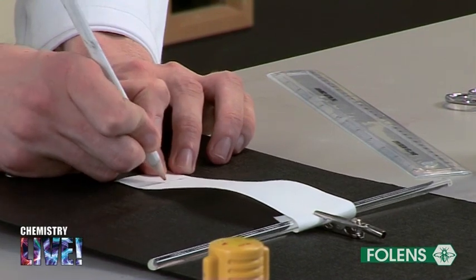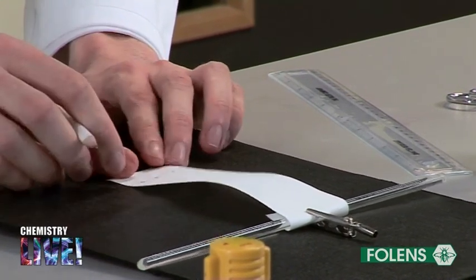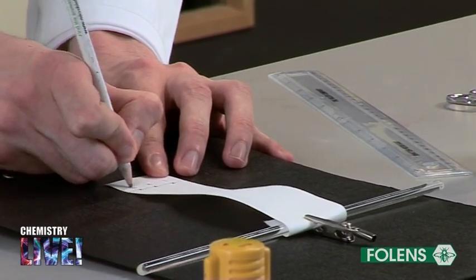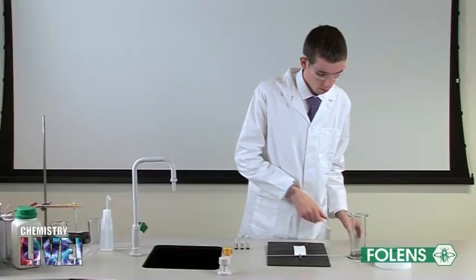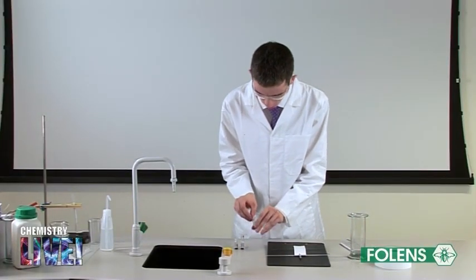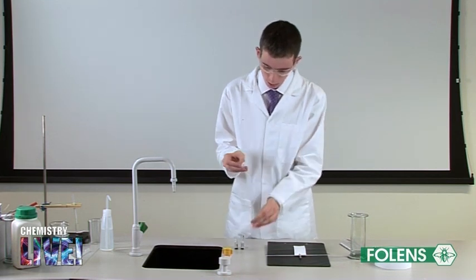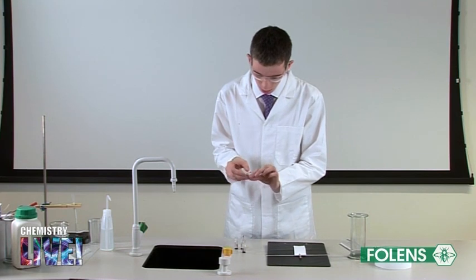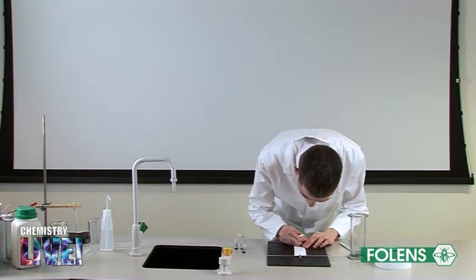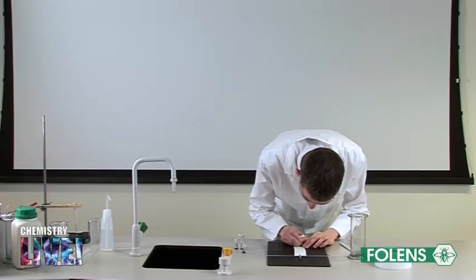Using the pencil, identify each sample of ink being analysed. Place a small dot of each of the 3 different coloured inks side by side on the pencil line. Make sure they are well spaced from each other.